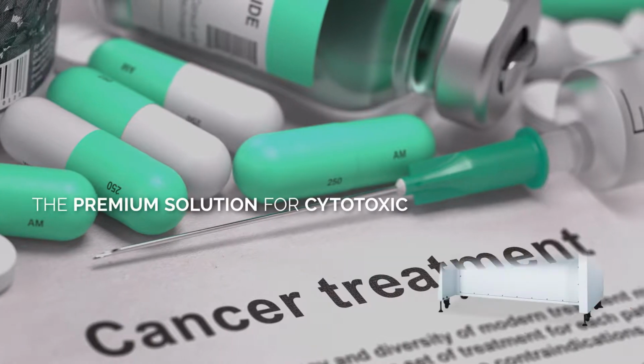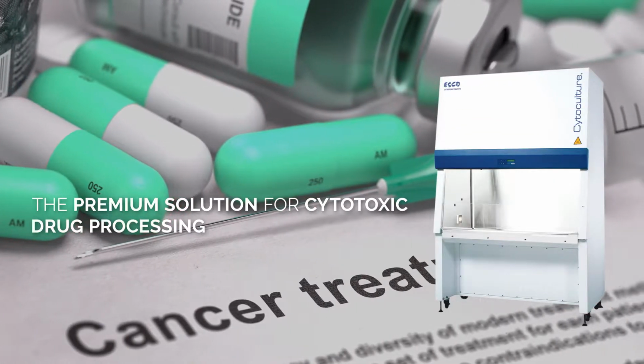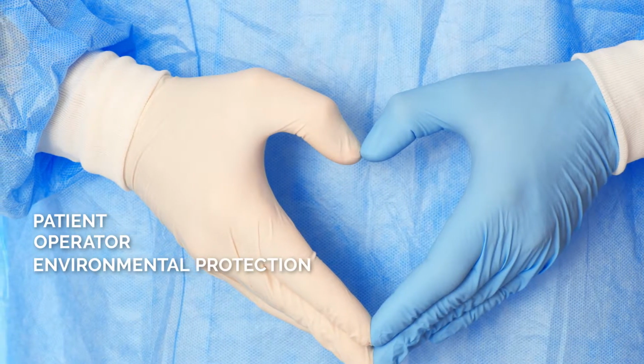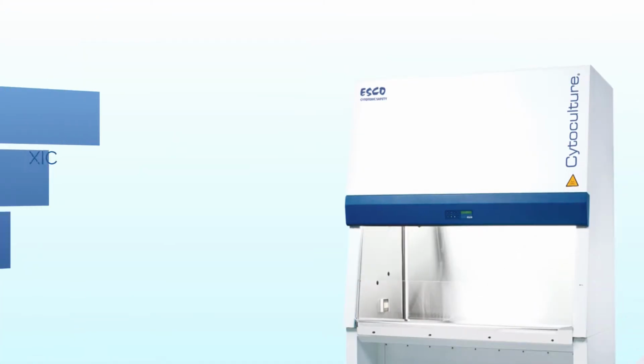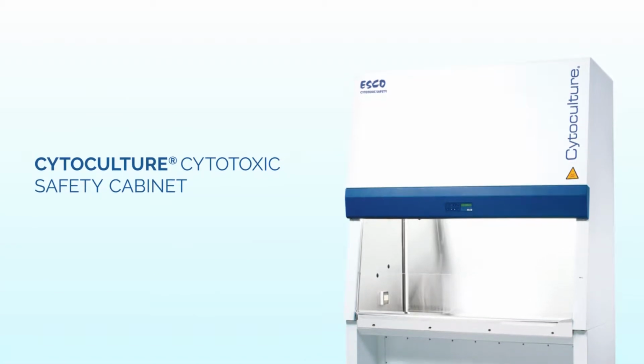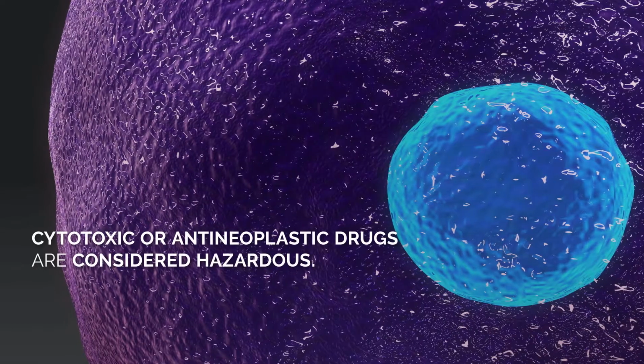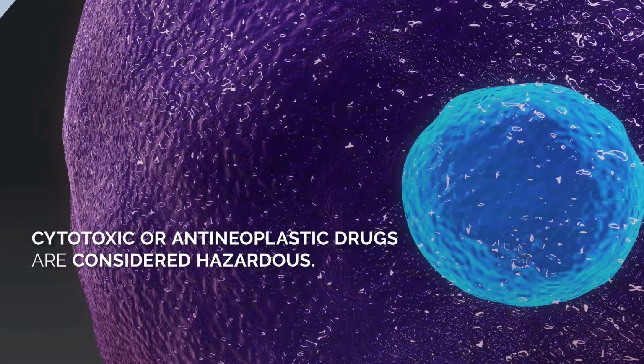The premium solution for cytotoxic or antineoplastic drug compounding, providing patient, operator, and environmental protection. This is a short demonstration of how to properly use the Cytoculture Cytotoxic Safety Cabinet. Cytotoxic or antineoplastic drugs are considered hazardous.